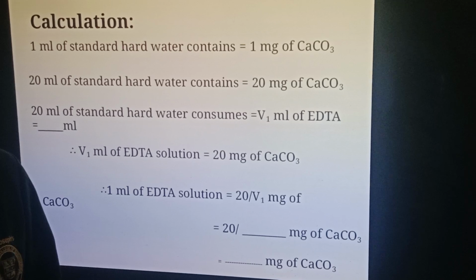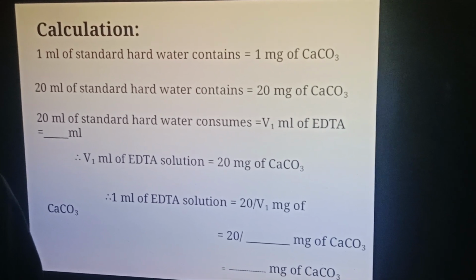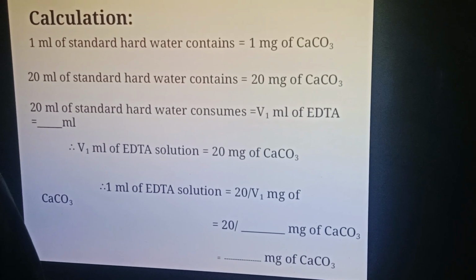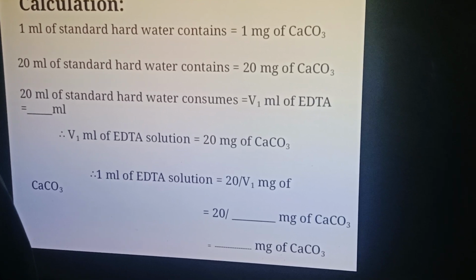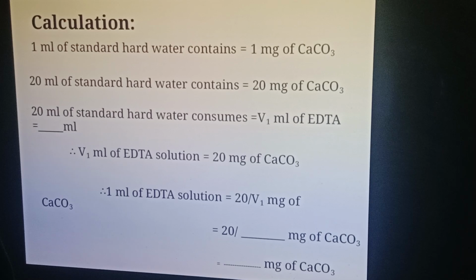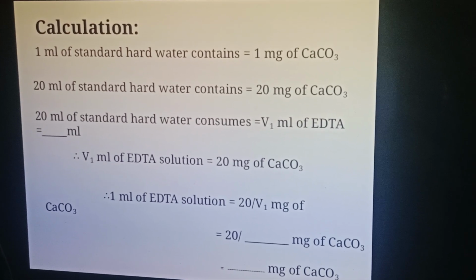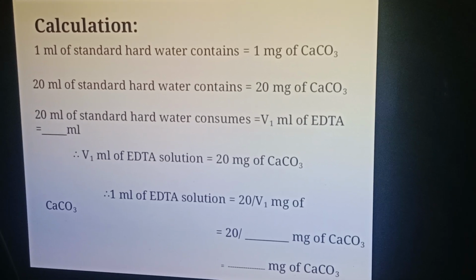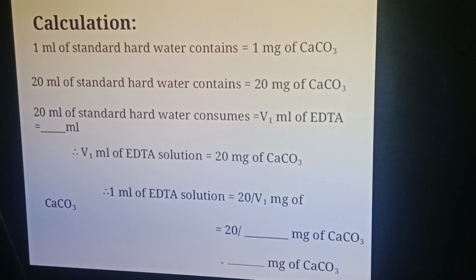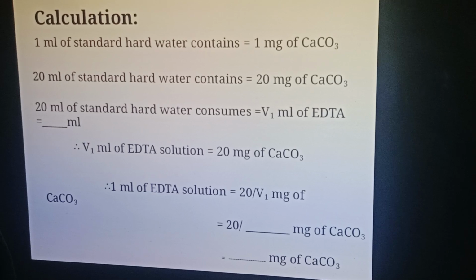This is the standard procedure. You must follow it in all volumetric titrations. I have explained it in detail now, so I will not be repeating it again. In the upcoming titration based experiments, please make sure you understand this method clearly and follow the same steps for all similar experiments. Since all volumetric titrations follow the same format, I have explained it completely here. From the next titration experiment onward, I will not repeat this step. So please apply the same procedure carefully.